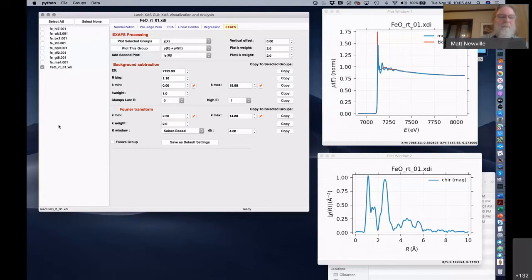Practically, the GUIs handling thousands would start to cause challenges. I think that any GUI handling thousands of data sets would cause challenges from a user interface point of view, not so much a data management point of view. But if you're writing scripts, you can handle gigabytes of data per minute.